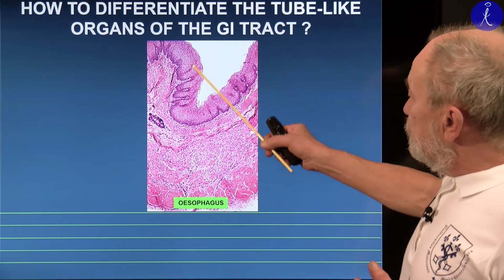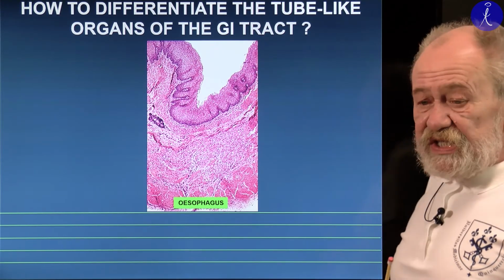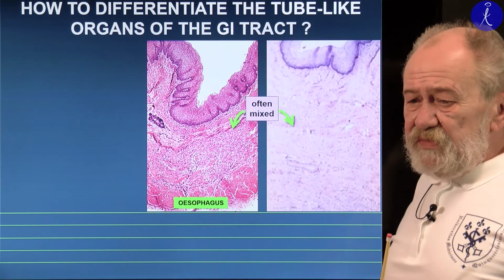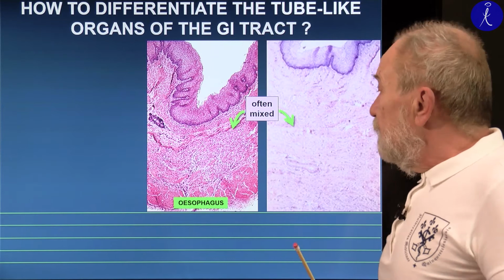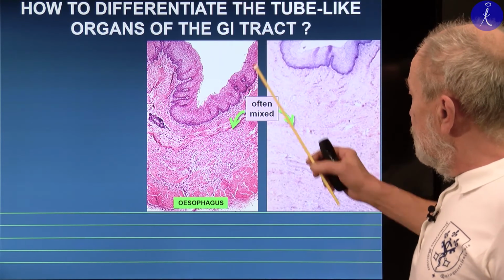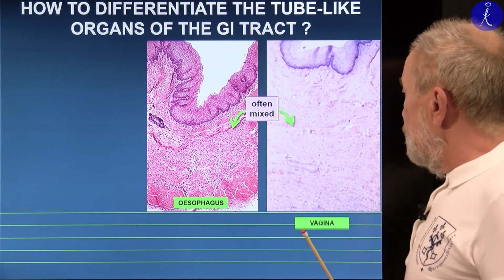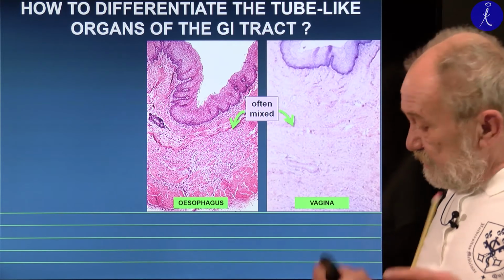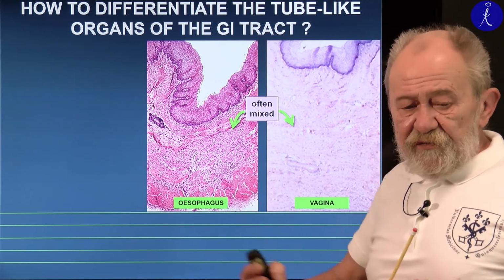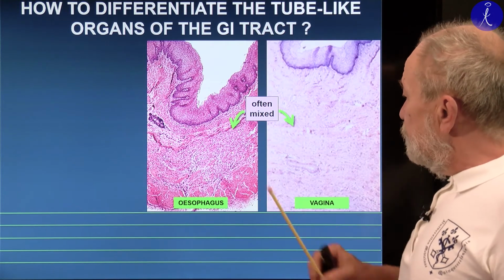I hope everyone recognizes that this one is the slide, the cross-section of esophagus, and this is extremely frequently mixed up nowadays with the other slide, which has the same epithelium, but almost this is the only similarity between them, and this other slide is the vagina. And again, by not even thorough but superficial thinking, I don't understand how these two slides could be mixed up.